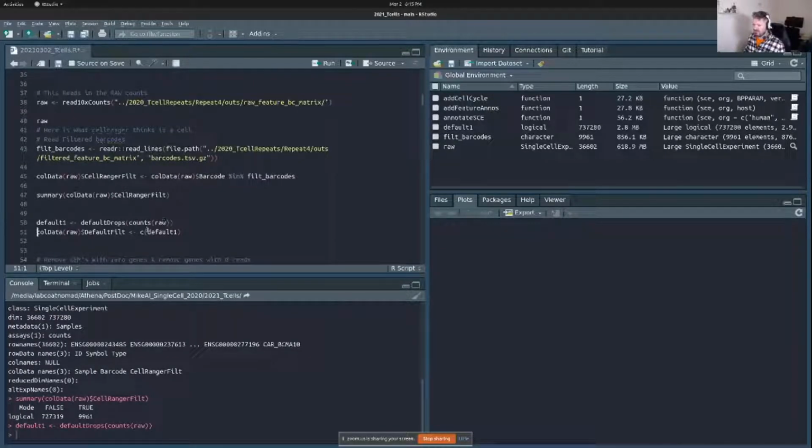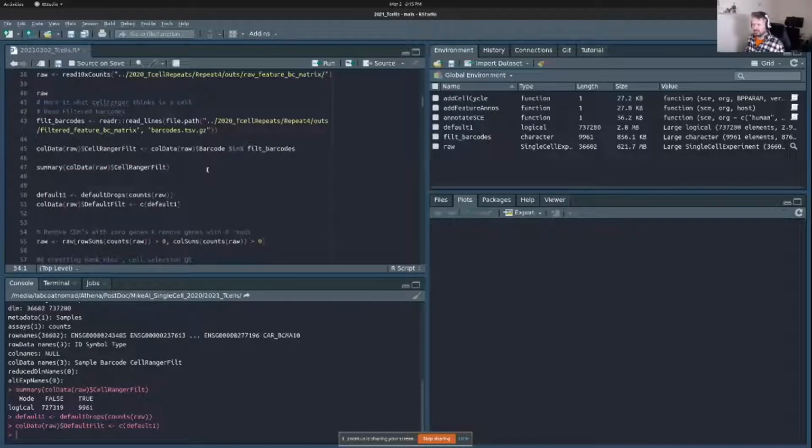Now you might notice that I'm adding this back into my raw, so everything's in one spot. I made this as a list because I normally handle multiple samples at a time. But this obviously doesn't have to be a list because we're just doing one sample. But if it was, you just put your next one there and so forth. You just put a comma and add more. So some of the stuff's copied and pasted from my actual working stuff. So I'll change things as I go, and I'll upload the final version if I've made anything else.